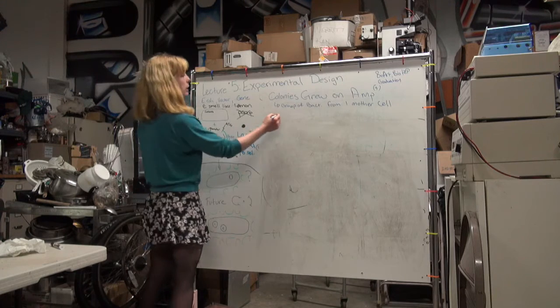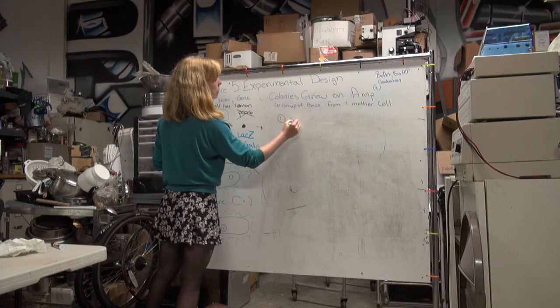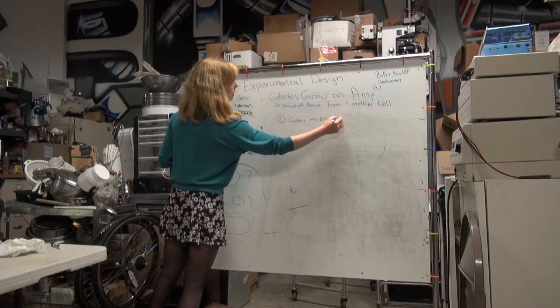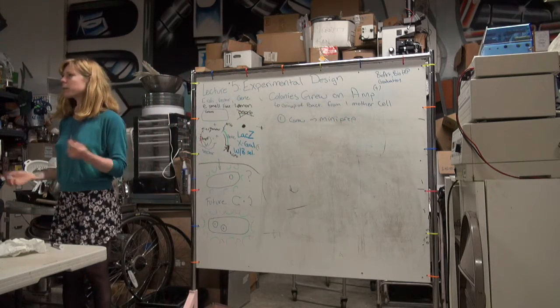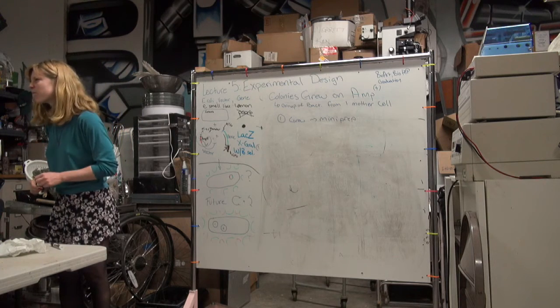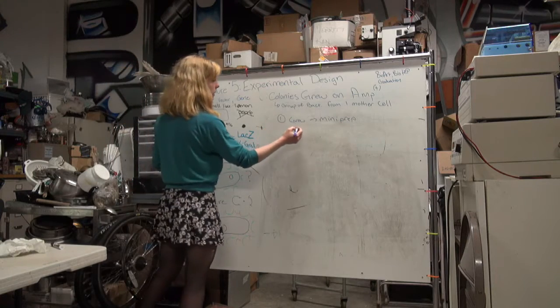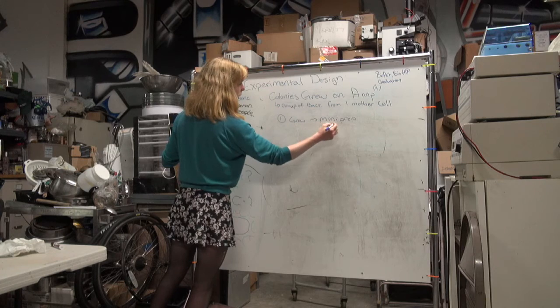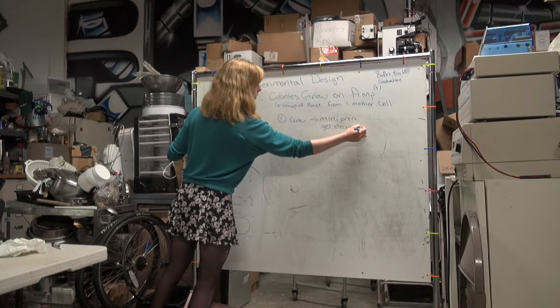So one of the first things we're going to do is grow these cells up and then do a mini prep. So sure, they grew, right? We're going to make sure they actually have DNA, like a plasmid-like DNA in them, right? About the right size. So first thing we're going to do a mini prep, and then to see that the mini prep got us something, we're going to do a gel electrophoresis.